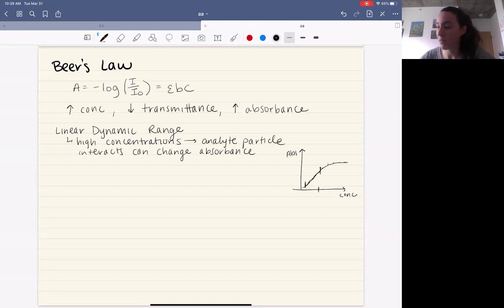And for calcium, this linear range stops at around 50 ppm. Okay, so we want to keep that in mind. Because we need to be within that range, we're going to need to make some dilutions in order to make sure whatever sample we send through our instrument is within the linear range of the instrument.